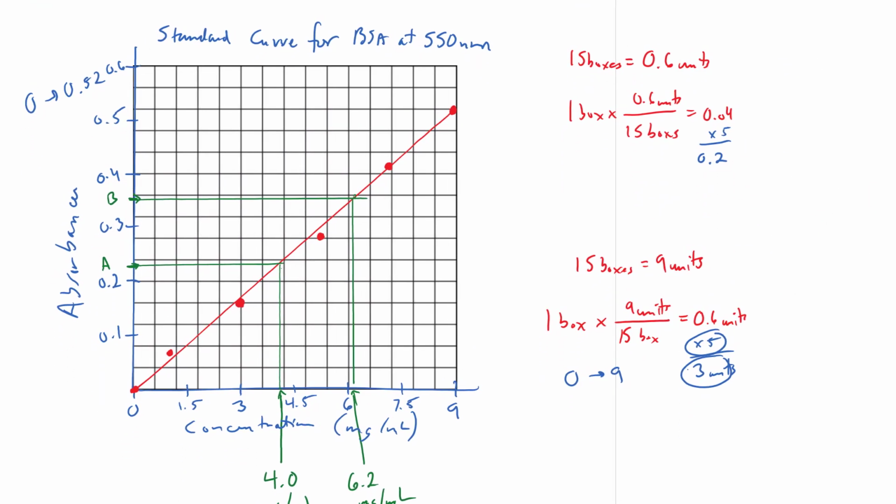So this is how you use a standard curve. You take a number of standards. These are concentrations that are known. We then use a spectrophotometer. We measure the transmittance. We calculate the absorbance. We can then plot that on our graph. Concentration as my horizontal independent variable and absorbance as my vertical dependent variable. When I plot that, I create a line of best fit. I will then use this line of best fit as my standard curve.